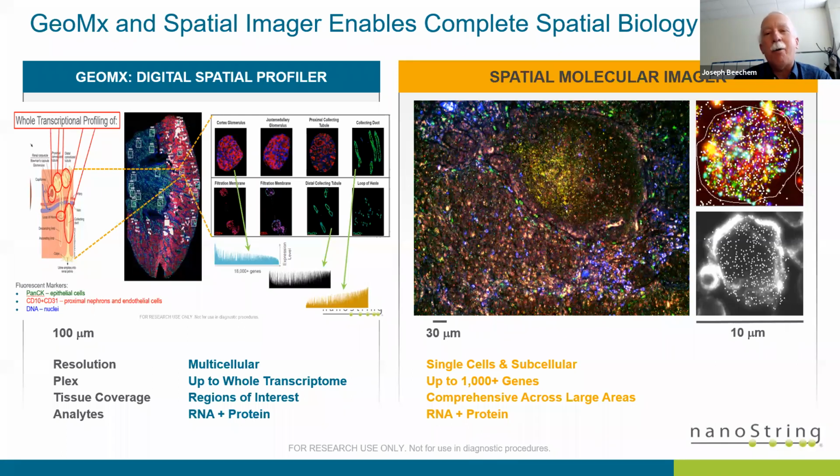And that's one of the powers of the mirror-based photocleavable oligo approach of the DSP. It is ideal for that kind of study. Because if there's 2 million little glomeruli factories in a kidney, I can just focus my light exactly where those glomeruli are. And I'm not wasting my sequencing dollars on all the stuff in between.